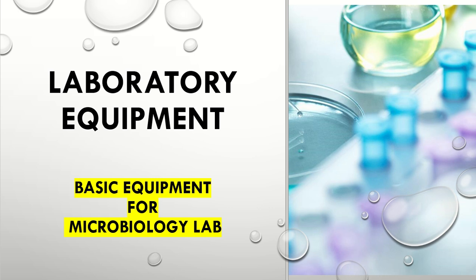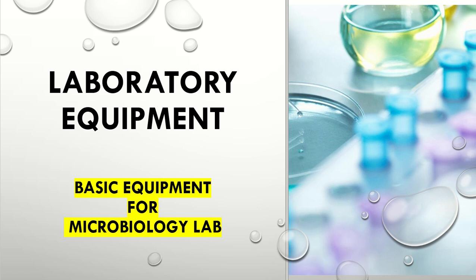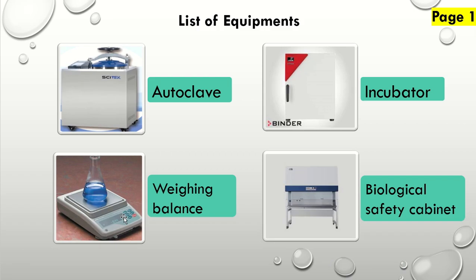Basics and activity records in our laboratory. Just like we were starting from the first slides, and this slide contains four equipments. First of all, this one is the autoclave that we normally use for sterilization of our media, biological waste and glass waste. We will use this autoclave.